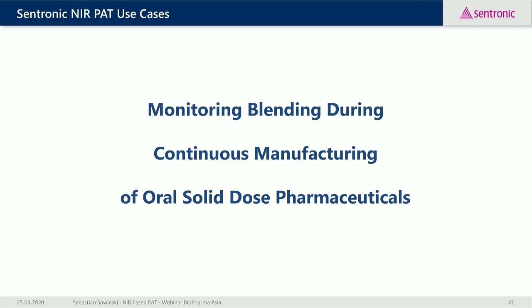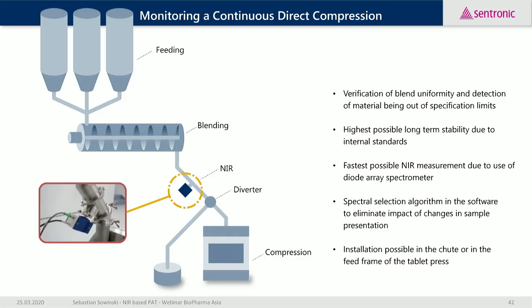Let me continue to go into a few more application-specific details. First, I'm going to show you something about blend BU monitoring during a continuous manufacturing. This again shows the CDC process as presented already by Tom.